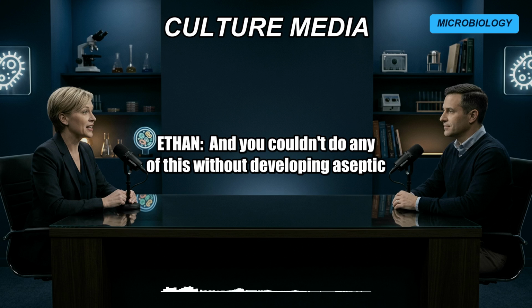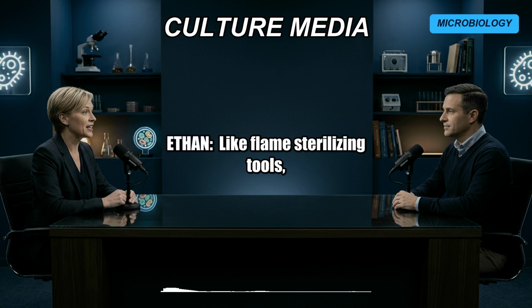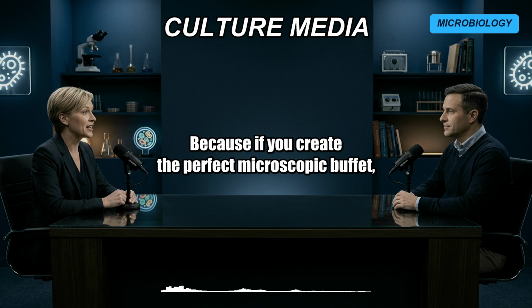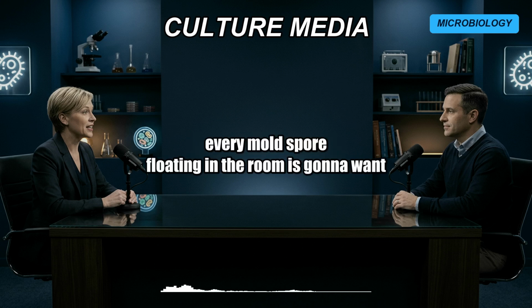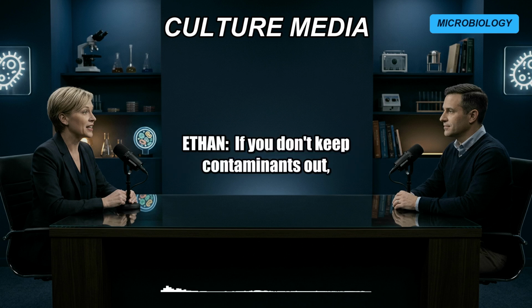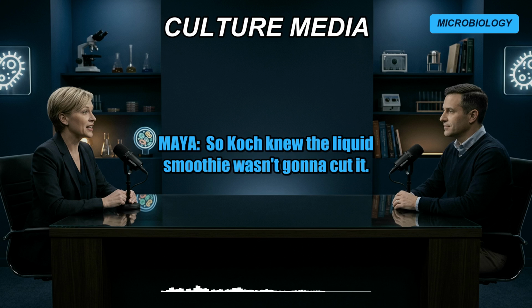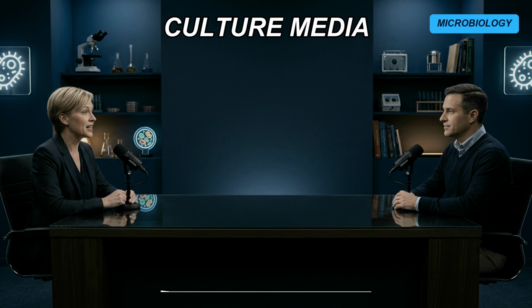And you couldn't do any of this without developing aseptic technique at the same time, right? Oh, absolutely. Like flame sterilizing tools, sealing containers. Because if you create the perfect microscopic buffet, every mold spore floating in the room is going to want a seat at the table. Yeah, they will crash the party instantly. If you don't keep contaminants out, your pure culture is completely ruined before you even start. So Koch knew the liquid smoothie wasn't going to cut it. He needed a solid surface.